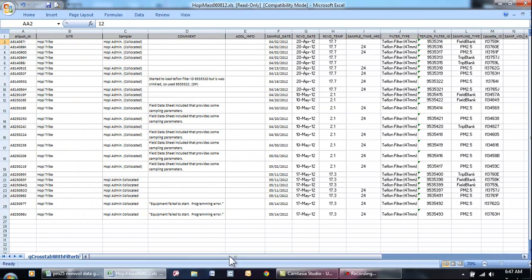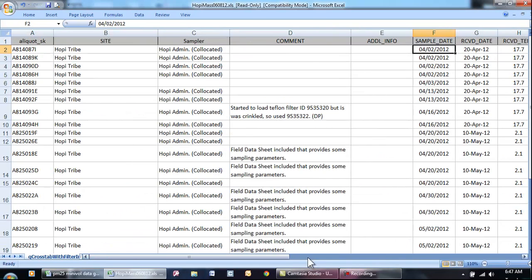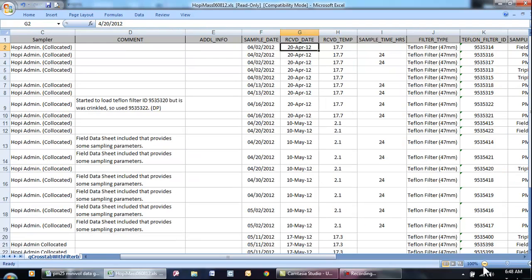So what you need to do to import into the spreadsheet with the graph is you need to look carefully at the date. And another thing that makes these reports very tricky, look at the dates. So I'm going to zoom in on this so you can see it a little bit better. If you notice, one of the dates says 4/02/12, and then there's a completely different date format in the next column. That's an indicator that you had better not copy and paste these rows from the RTI sheet into your data, where you're keeping your data in your spreadsheet, because these dates are going to come out probably formatted as text and then not be able to be used in graphs or calculations. So you want to be really careful when using these RTI data sheets and probably end up typing in the information yourself rather than copying and pasting.